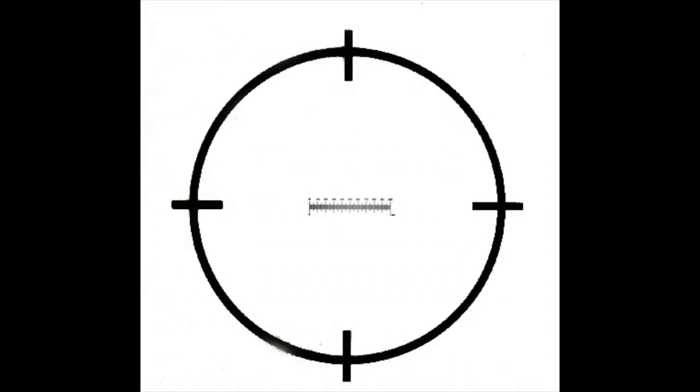If you have listened to the explanation of centering the subject of interest on your slide, I recommend you do what it suggests before moving to the 10x objective.